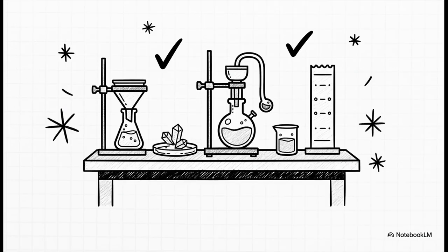And that's our grand tour of purification techniques. It might seem like a lot at first, but it all comes down to choosing the right tool for the job based on the physical properties of your mixture.